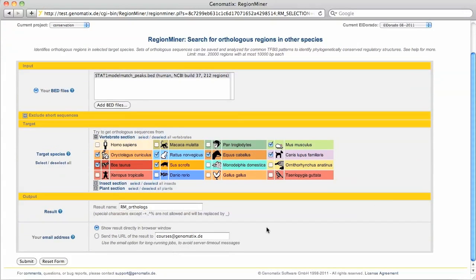As the analysis will take some time, I choose this option to let the system send me an email when the result is ready.